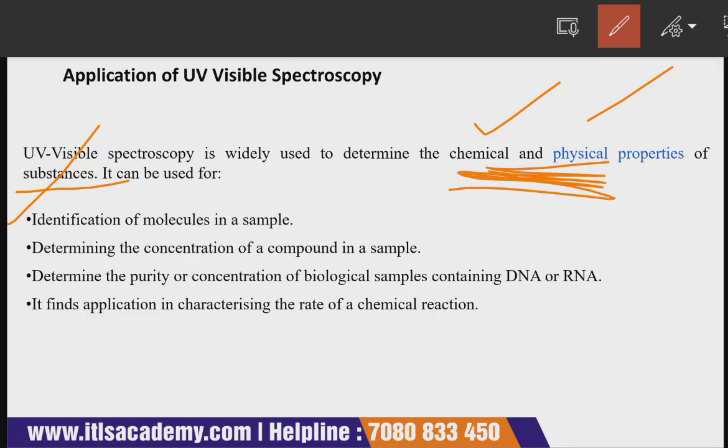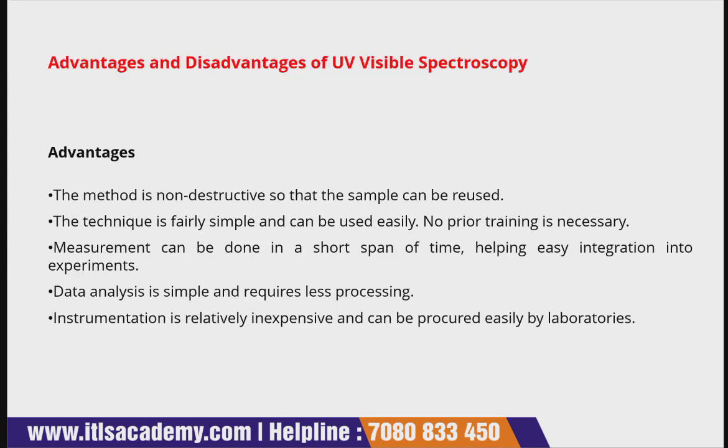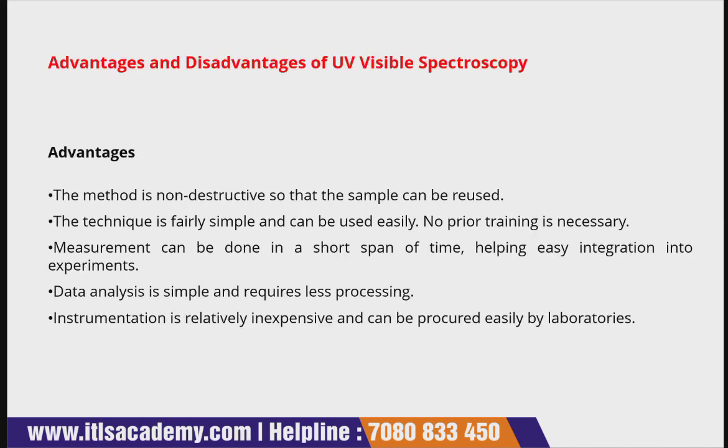So it has very huge applications. Now moving to the advantages and disadvantages of this technique. Whenever you are talking about the advantages, this method is non-destructive, so the sample can be reused. You can use the sample again. How? Because this method is non-destructive.